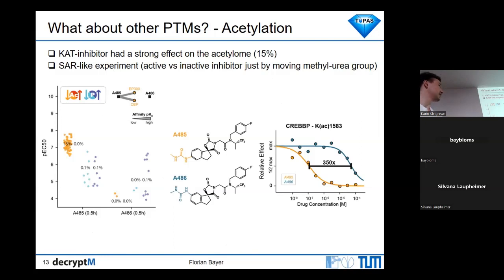What I like actually is that it's a huge effect. It's like 15% of the acetylome is changed just by this very potent acetyltransferase inhibitor.